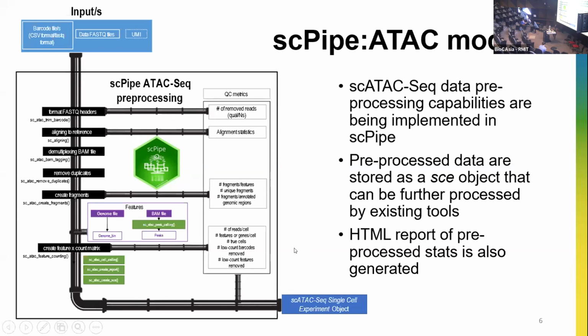So where was I? Okay, so the HTML report at the end would show you all the QC things that you've done and what happened to the data. But also you would have other stats files and a log file. So if you want to look more closely into the things that you don't understand about the data, you can actually do that as well.